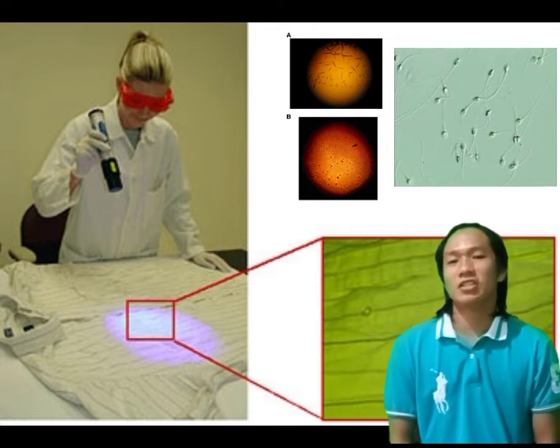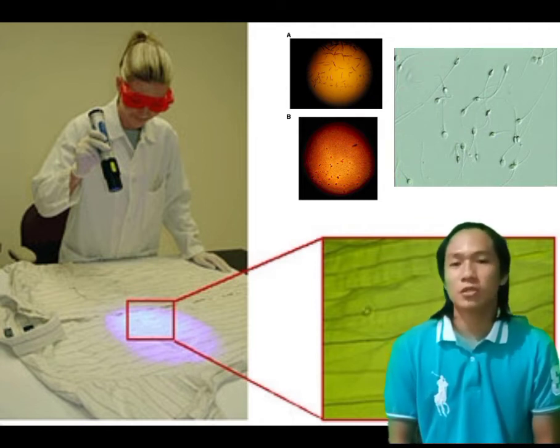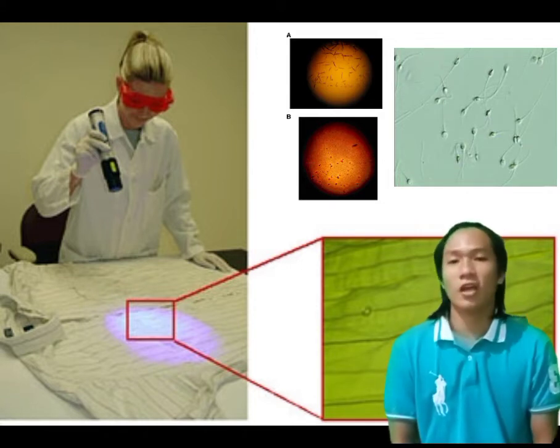How are seminal stains collected? For semen and seminal stains, use a clean syringe or disposable pipette to transfer liquid semen to a clean sterile test tube. Label the tube with the case and item number, name, time, location, and name of the collector. Keep the specimen refrigerated and submit it to the laboratory as soon as possible.